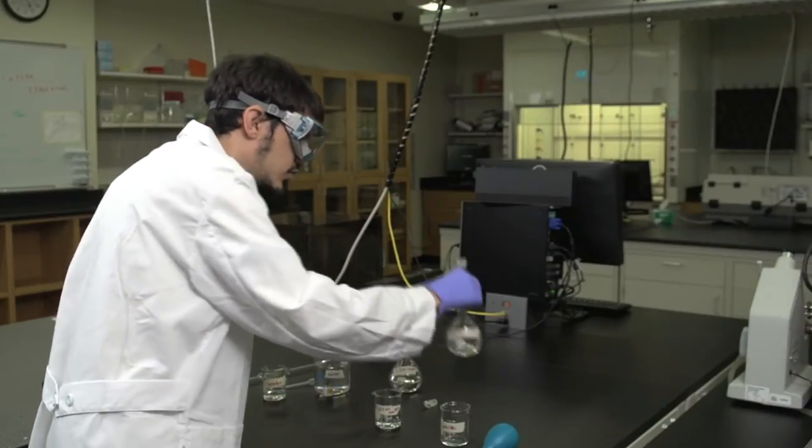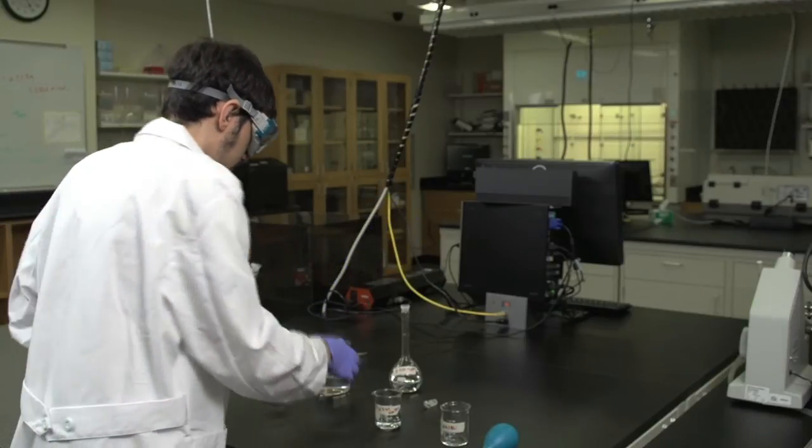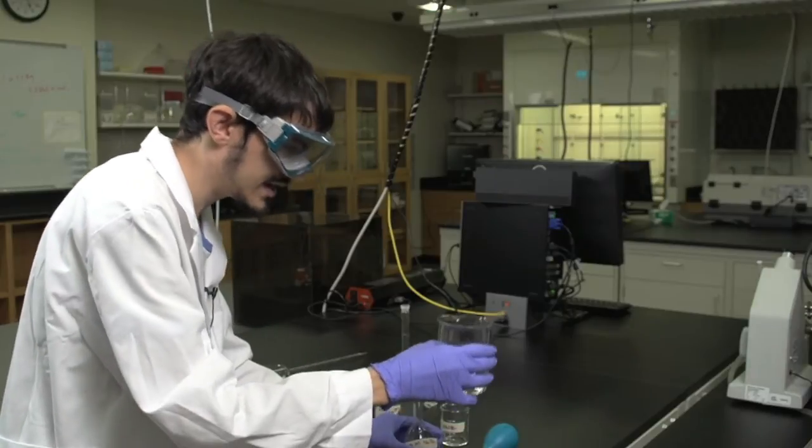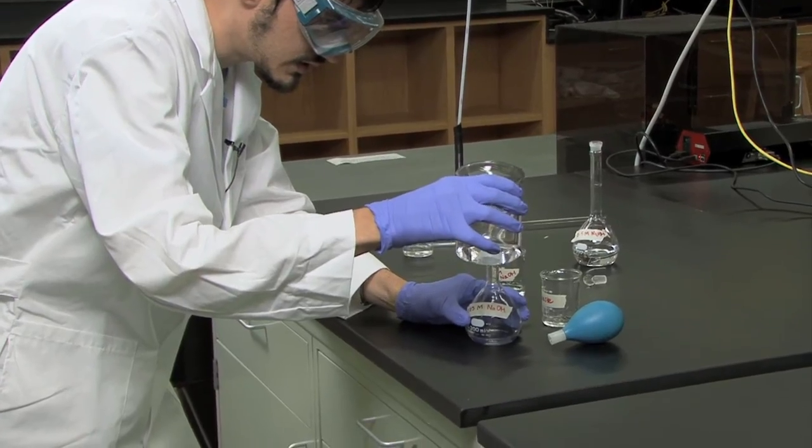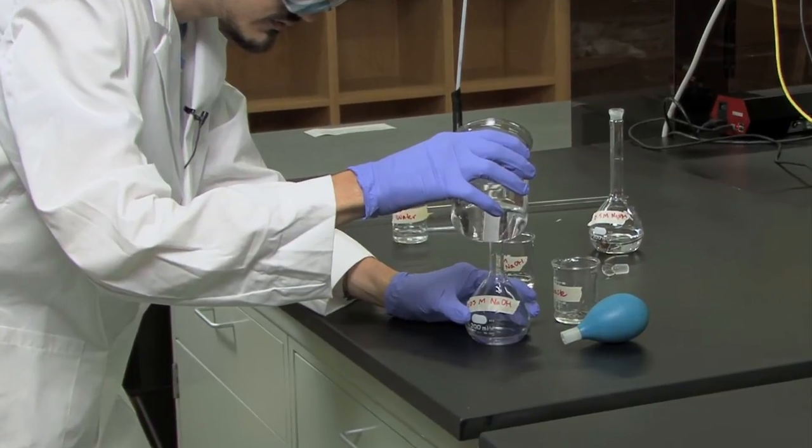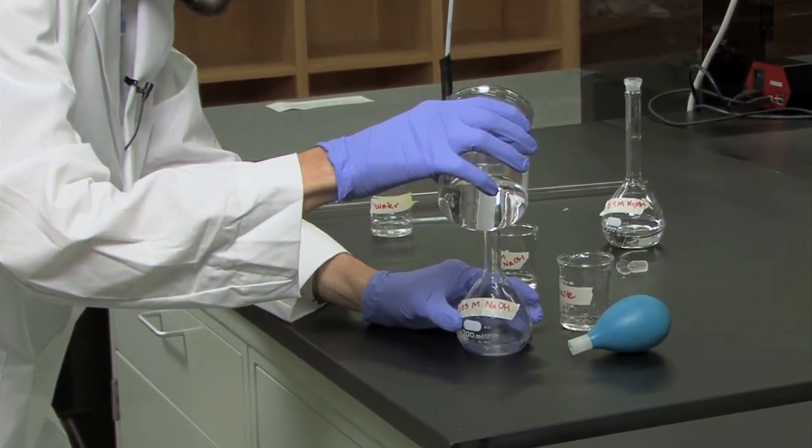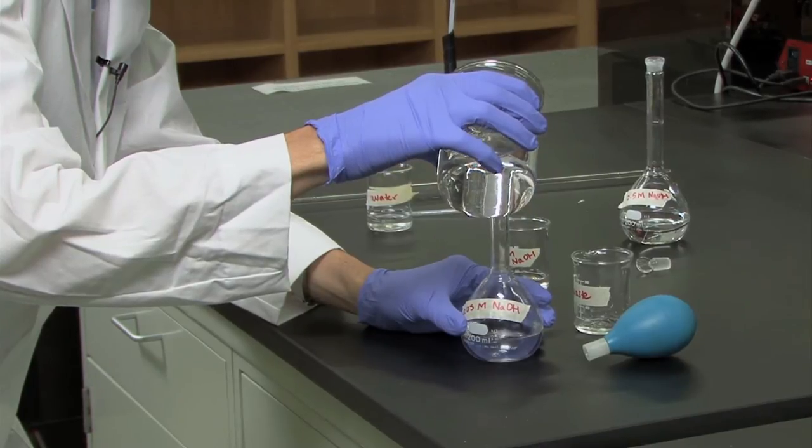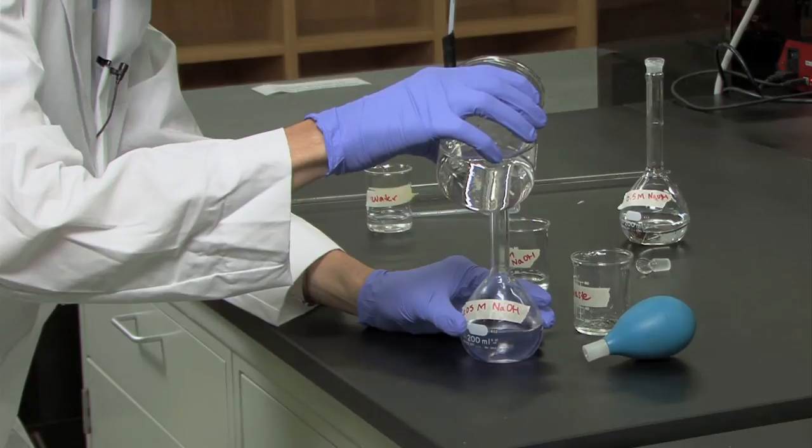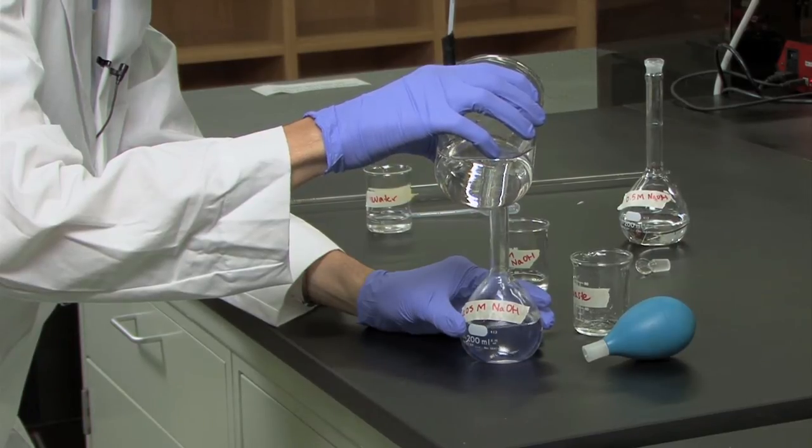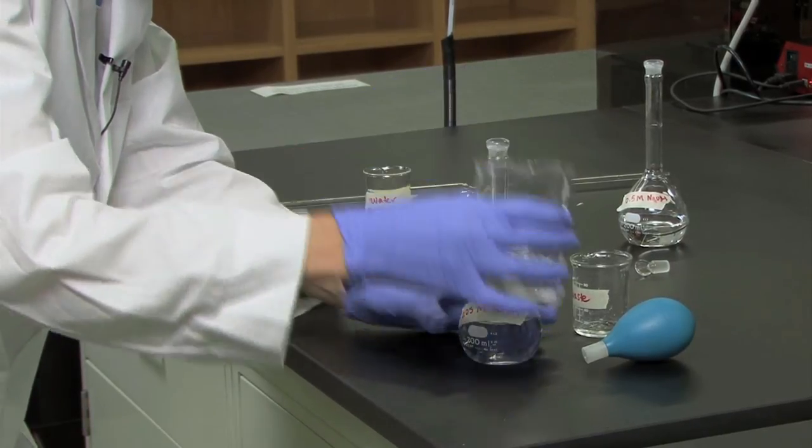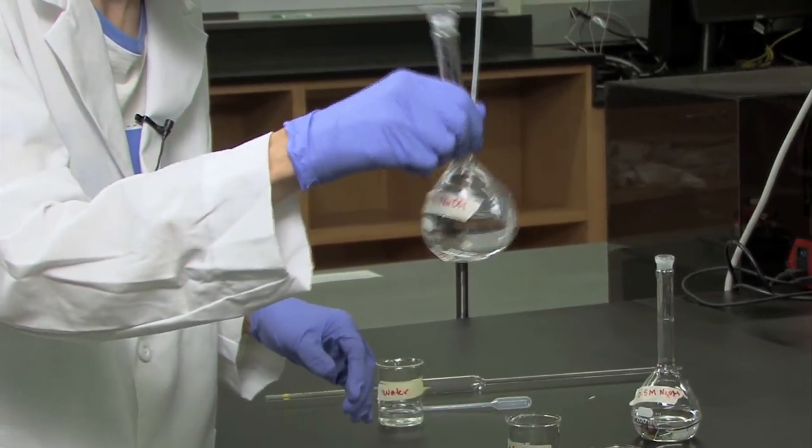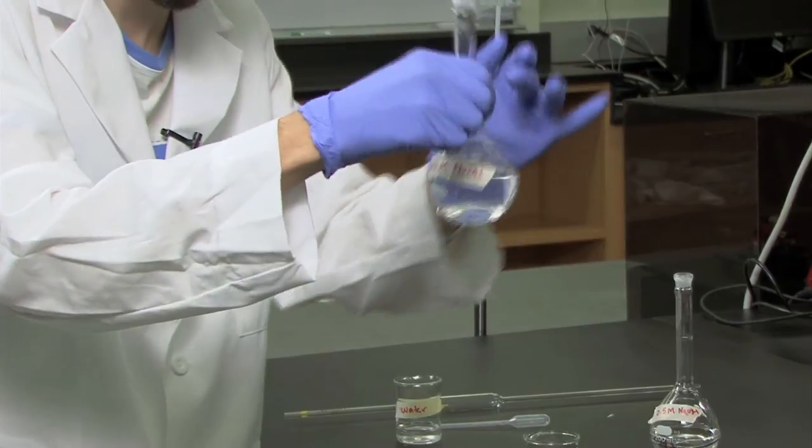You are now ready to dilute the solution. During the first part of diluting, take a water beaker and start pouring water in. You will want to swirl at least several times to aid the mixing process before the water gets up the neck of the flask.